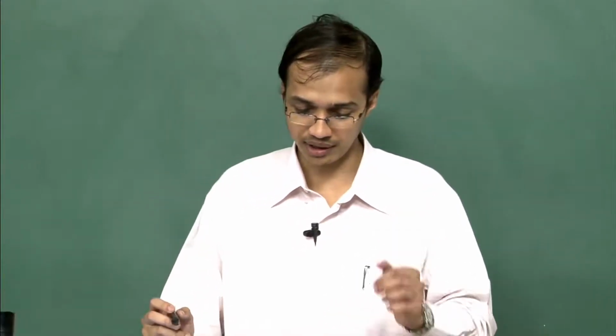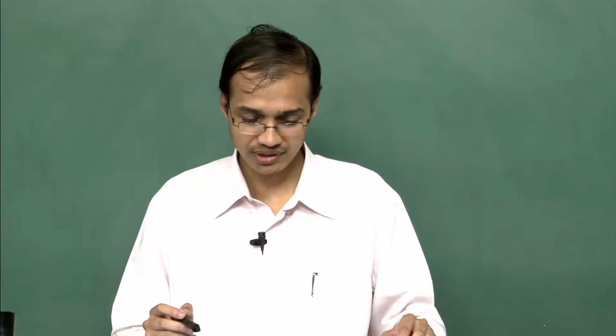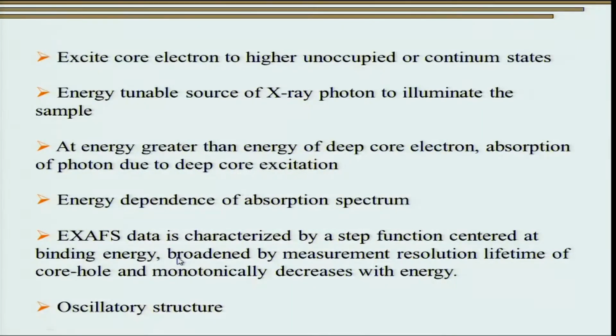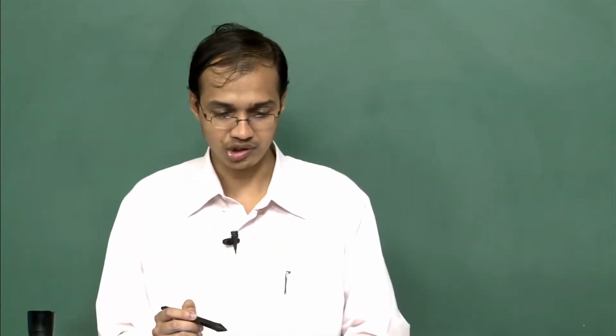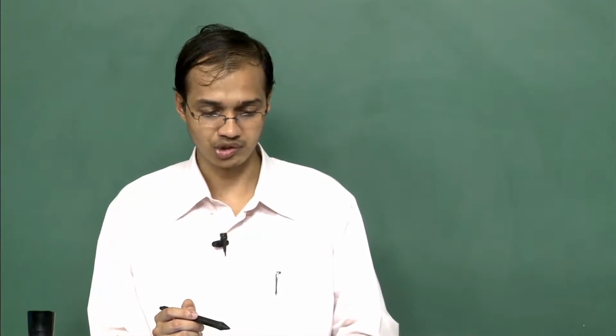So, as we can see, the EXAFS data is characterized by a step function centered at the binding energy, broadened by measurement resolution and the lifetime of the core hole, and it monotonically decreases with energy. Remember, what we are getting is happening at the absorption edge. So, let us go back and just look at the absorption edge.